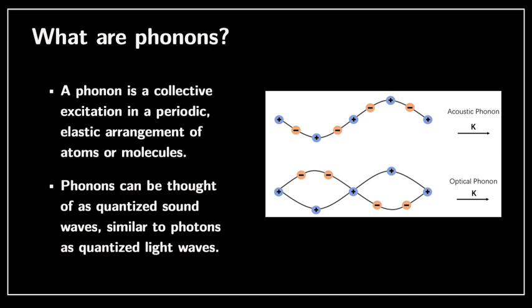The reason for this is that every other atom is vibrating out of phase. So when a minus goes up, a plus goes down, and so on and so forth. In other words, you have a creation of a dipole moment, and in fact even a change in dipole moment, and therefore if you have a dipole moment or a change in dipole moment, you can interact with an electric field. And since in optics, or light, you have an electric field, as I reminded you 20 minutes ago, this kind of vibration can couple with light.